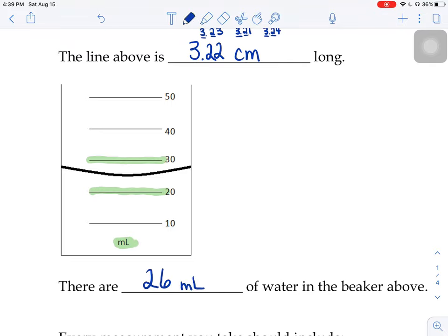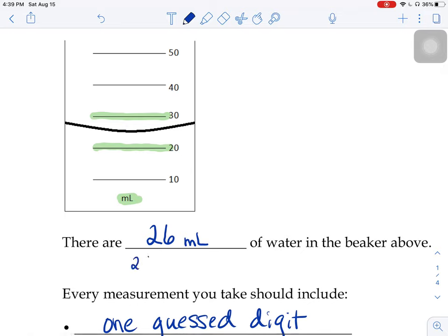Maybe you're looking at it, and you with your eyes think it looks like 25 or 27 or 24. That's okay. All of those are correct answers because we have a guest digit. There is no way for us to know what the exact right answer is on that last digit unless our instrument had additional markings. That's one of the reasons that we don't use beakers to measure liquids, because the markings are so rough that we don't get a really accurate reading using those beakers.